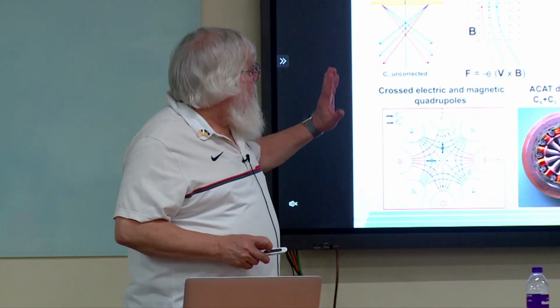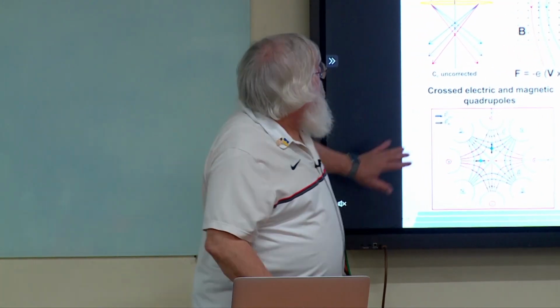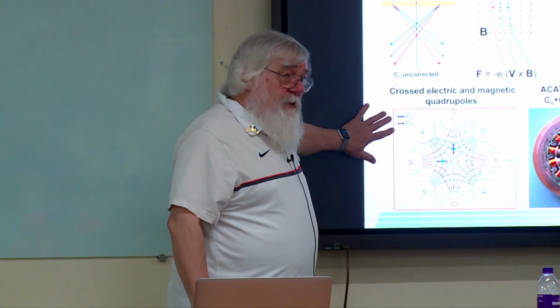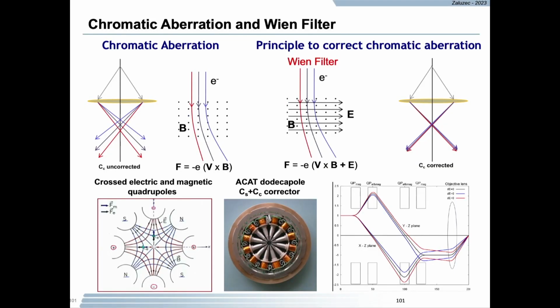Okay. I was going to say, in addition to the spherical aberration corrector, we can put chromatic aberration correctors in. Those are even more complicated devices than a simple spherical aberration corrector, which only has maybe 50 or 60 lenses. Okay, I'm probably exaggerating there, but it's a lot.